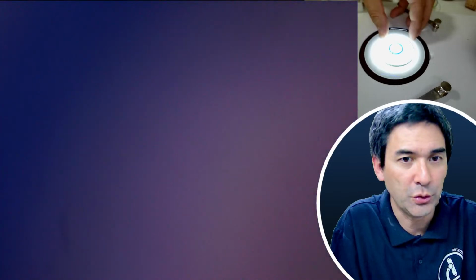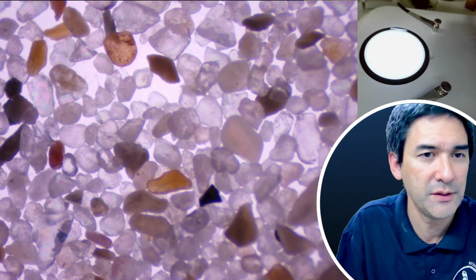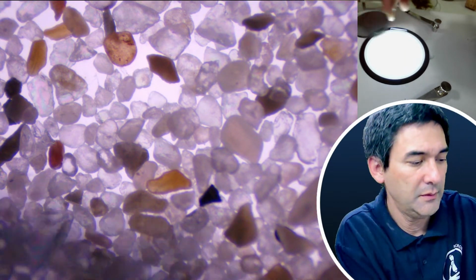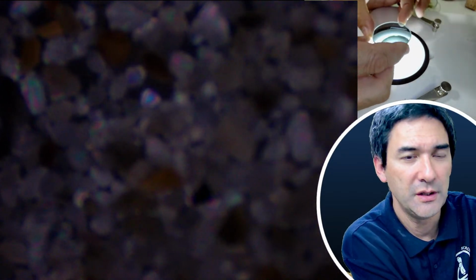The filter goes on top, the sand goes on top. I have to focus this a little bit better again. Okay, it's a little bit dark, I feel. So, and now the other filter goes on top, and we're going to cross it.